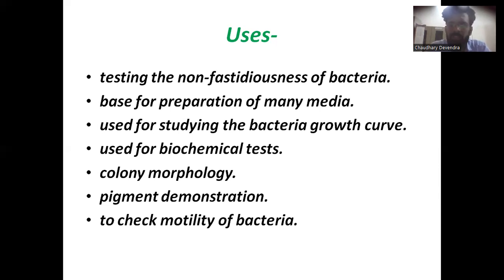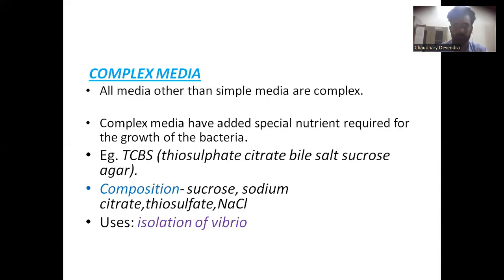Base for preparation of many media. We use it as a base of the medium to prepare many other culture media. Used for studying the bacterial growth curve, for biochemical tests, colony morphology, pigment demonstration, and to check motility of bacteria.